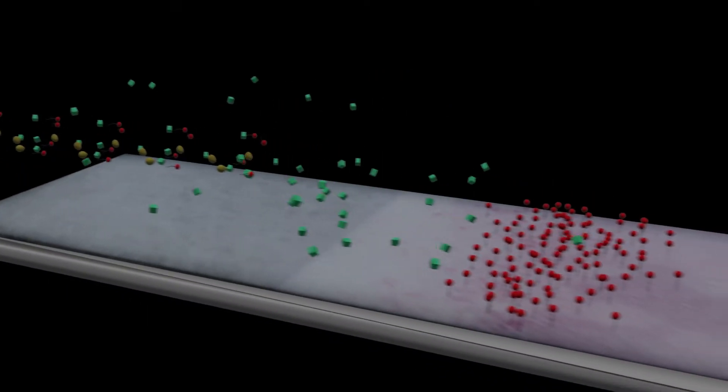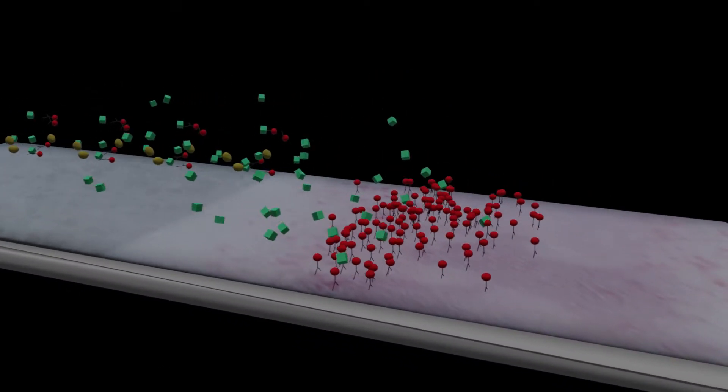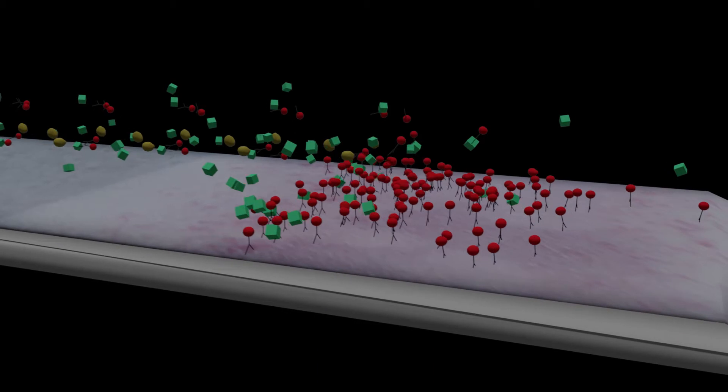The sample is added to the lateral flow device. Liquid drawn up the device picks up the color-labeled antibody striped onto the reagent pad.